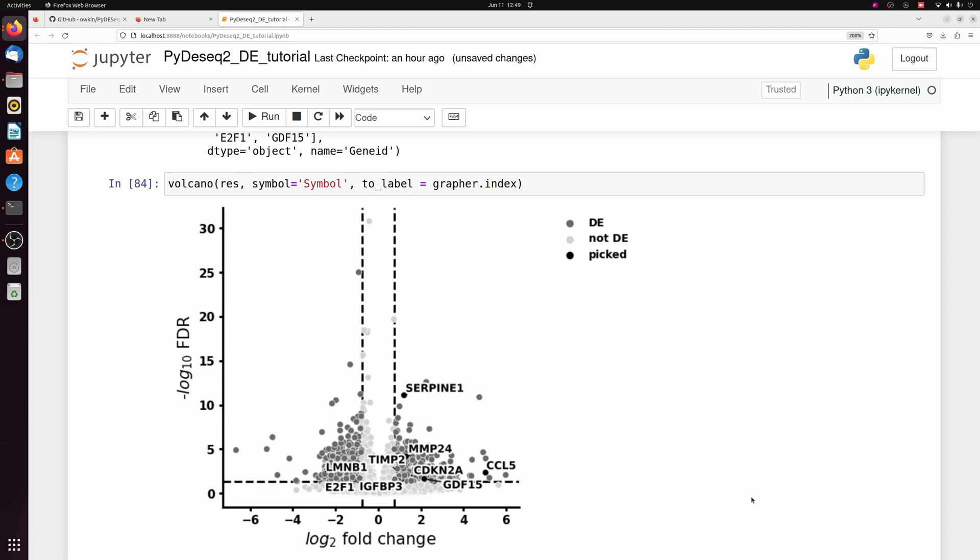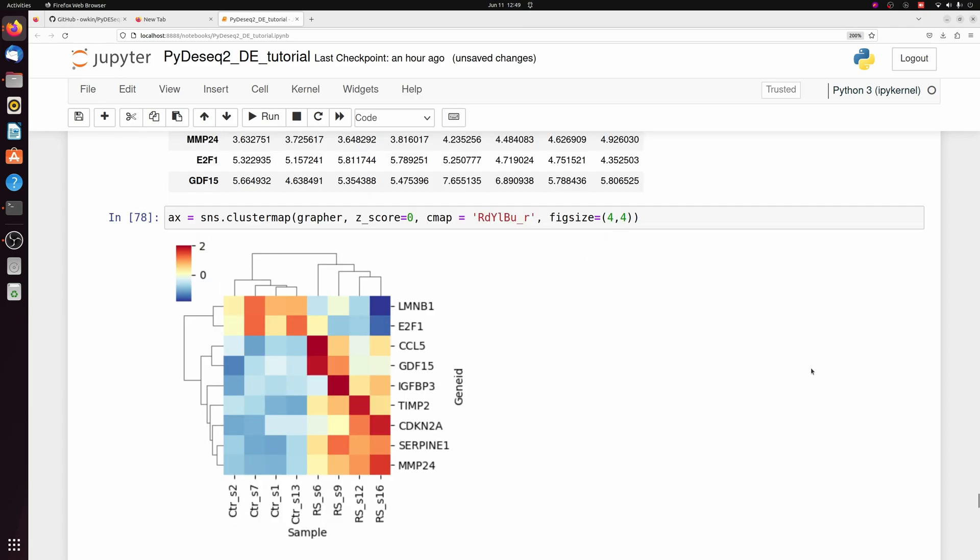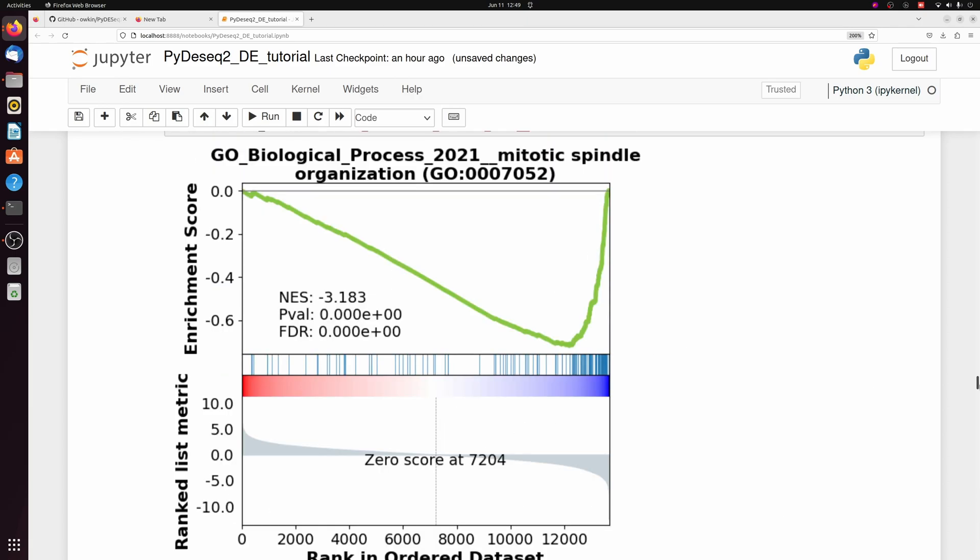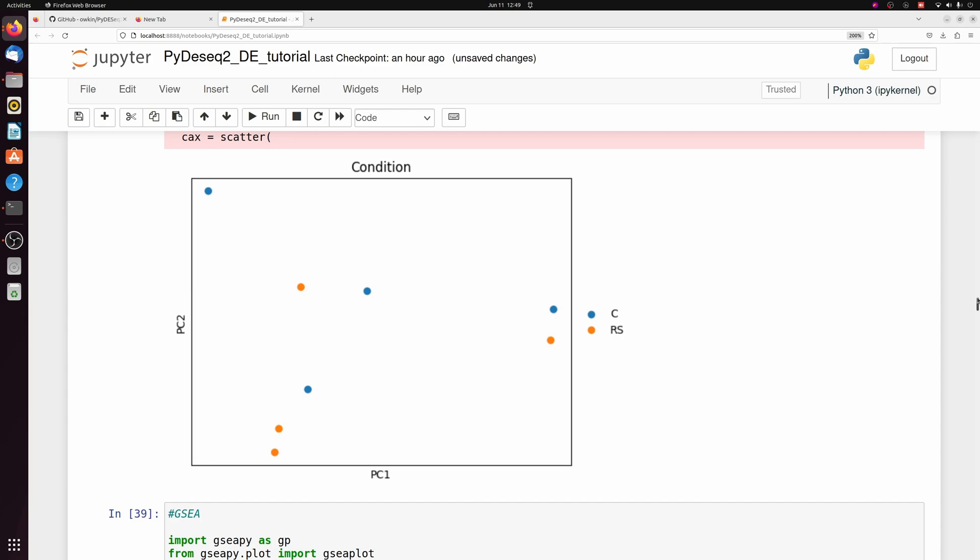But anyways, here was a very basic run-through of differential expression using PyDseq2. And we did some basic things like plotting volcano plots, heatmaps, GSEA, PCA, and importantly, it was all done directly in Python without having to do any crosstalk between R.